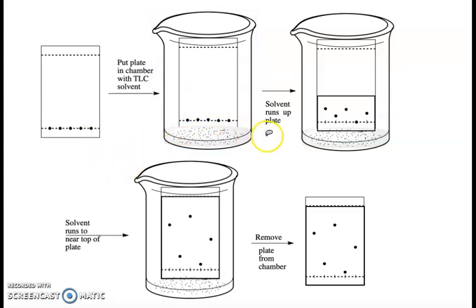So we let it sit in the solvent and capillary action pulls the solvent up the plate. You can see that it's running up the plate. So we let it run further and further until the solvent gets almost near the top of the plate. Then we stop it by removing the plate from the chamber. And what do we see? We see that some compounds are less polar and the less polar compounds move towards the top of the plate, whereas some compounds are more polar and they barely move at all. And you can see the less polar compounds are these two, the more polar compounds are this one, and this one's kind of in the middle.